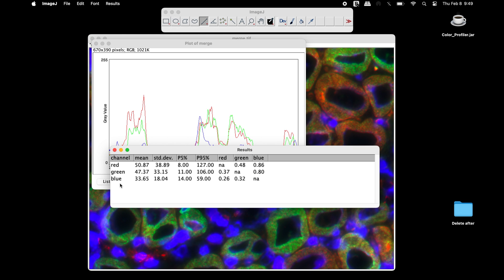In the results window, users can find the name of the channel colors, mean, standard deviation, along with other information.